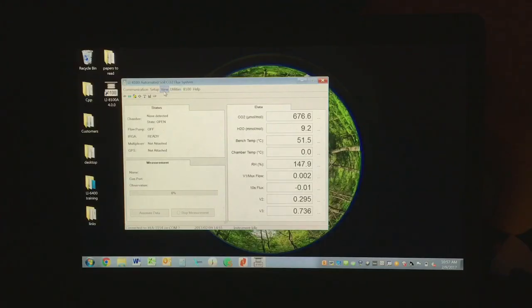The other tabs at the top allow you to view the instrument status, the error log if there are any errors present, summary records and reports for viewing logged data. The Utilities tab allows you to go to File Manager to download your data, manual controls to manually open and close chambers and turn off pumps, calibration to configure your CO2 and water vapor measurements, charting where you can graph data, and other values.